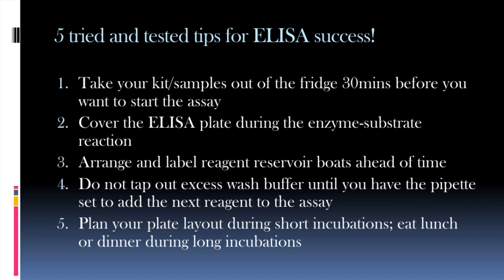In other words, you don't want your freshly washed plate that you've tapped all the wash buffer out of to sit on the lab bench for 5 minutes while you try to find the wash buffer or a different buffer or substrate, and pour it into the reagent well and set up your pipette to the right volume and pick up your reagent and then put it into your well. You want to be prepared. So it helps to arrange and order all of the reagents that you're going to use in their reservoir boats and label all of them so that you can quickly run through the process.